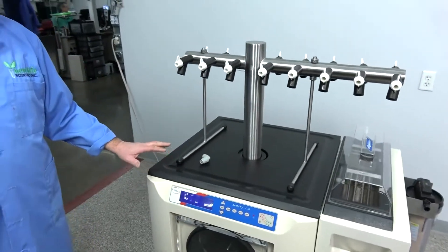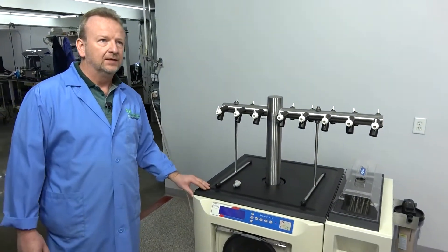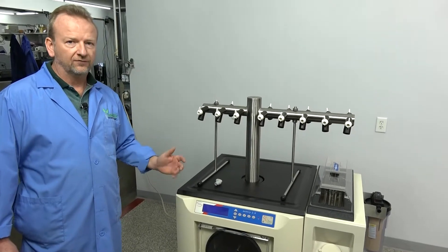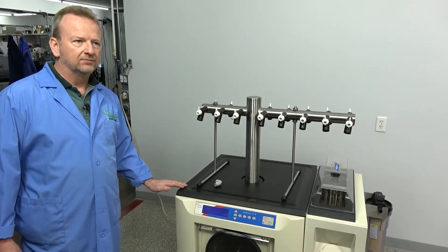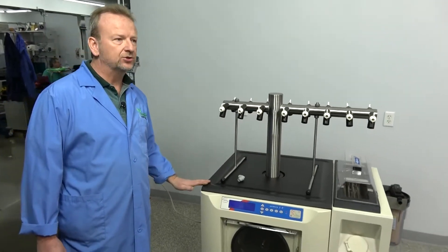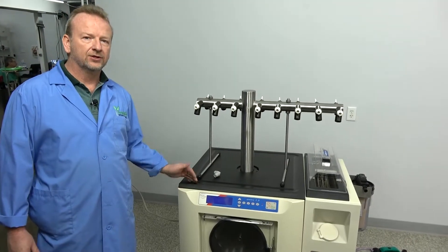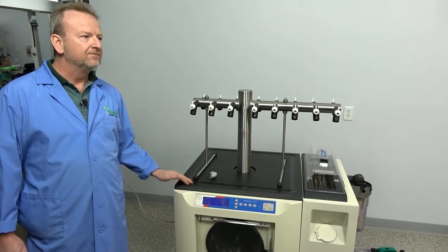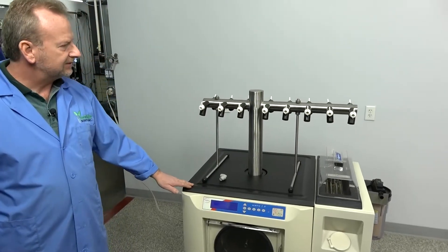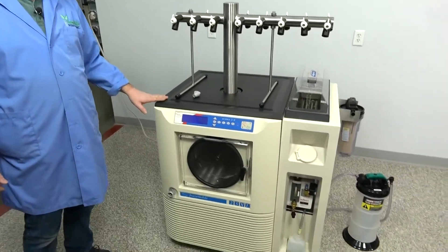The best part about this machine is it's actually an auto-cascading machine, which means it's only using one compressor with two refrigerants. Bottom line is you can run and get the cold cryo temperatures and still just use a 110 outlet — plug it in rather than the 220 that they normally would have — because it only has one compressor in it. This is the 25 XL, which has that option.